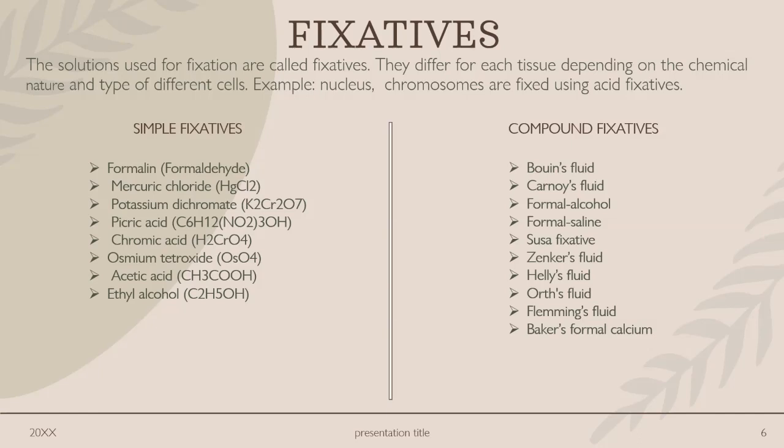Simple fixatives are nothing but a single chemical solution. But when we take compound fixative, it is formed of two or more chemicals. So these fixatives have some specific functions.